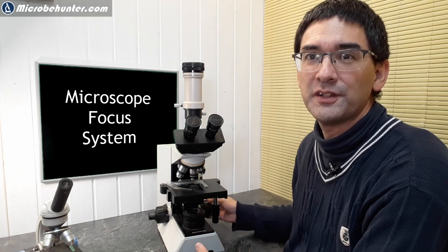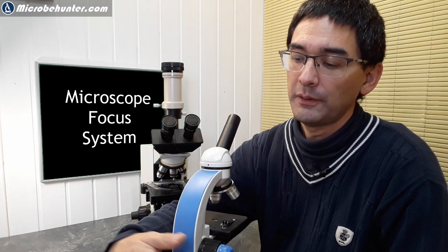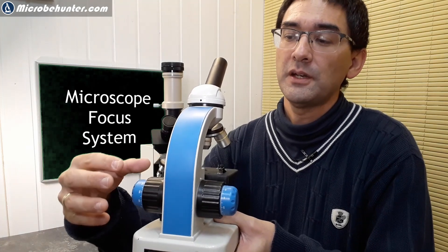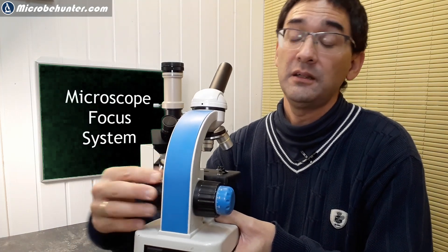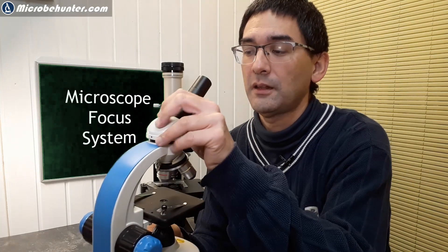So why do you need another knob on the other side? There are actually a couple of reasons. One reason is: why not? There is an axle running through the microscope anyway, so if there's a focusing knob on one side and the axle runs through it, you might as well connect one on the other side as well. This also allows left-handed people to use the microscope.